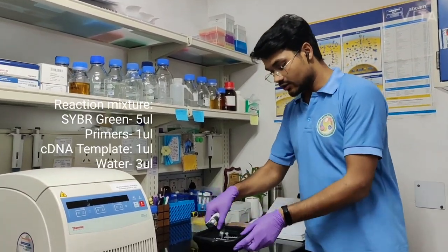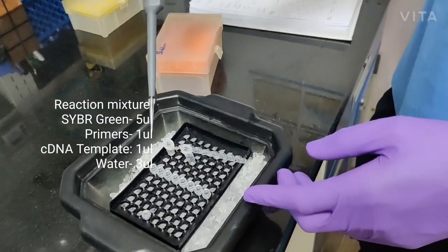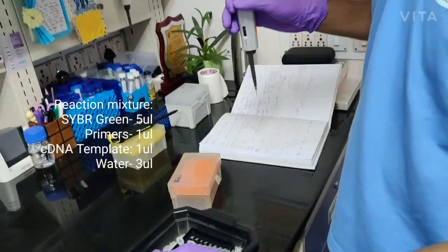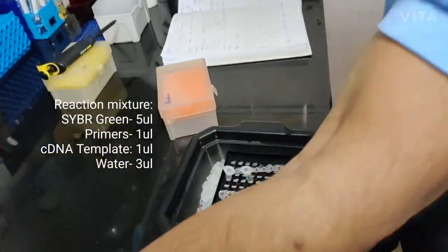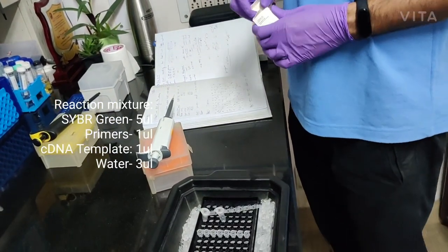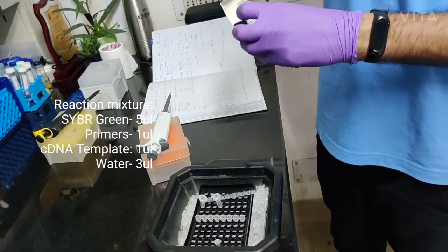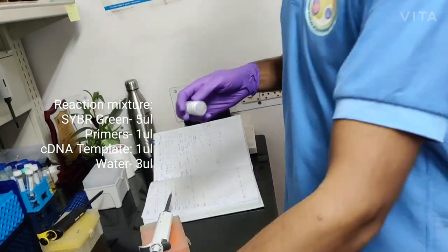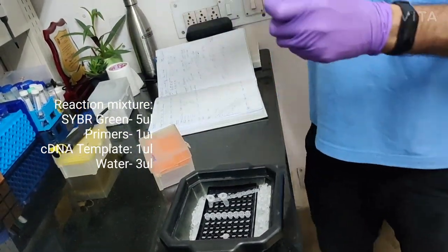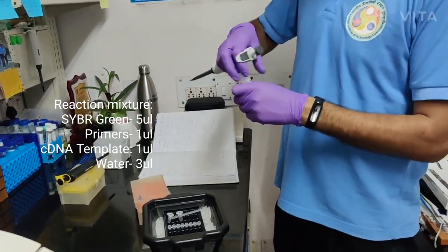So as you can see, these are the tubes for the real-time PCR, and I'm using three tubes, three sets for a single sample. So this is the sample, and I will be amplifying with the SYBR Green. For a 10 microliter reaction, I will require 5 microliter of SYBR Green. So I am going to add 5 microliter in each tube.